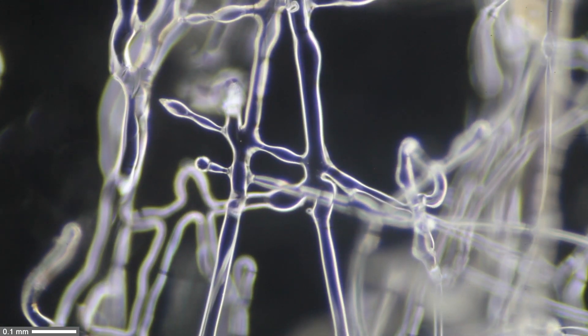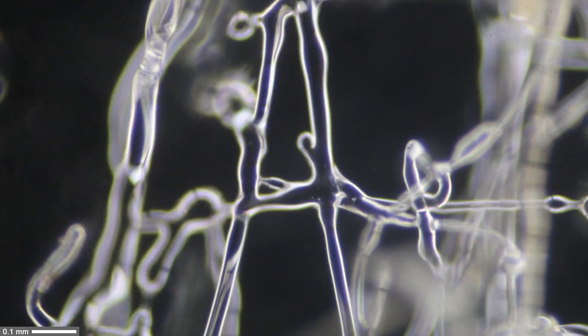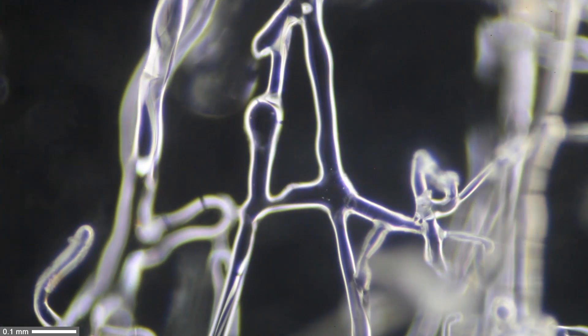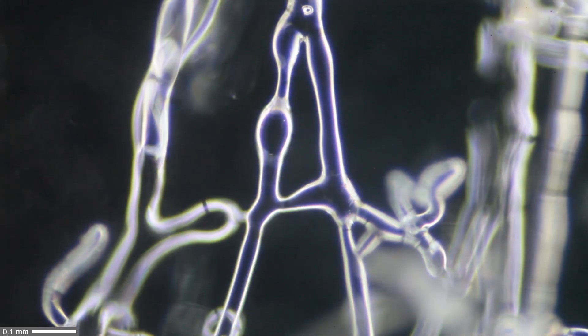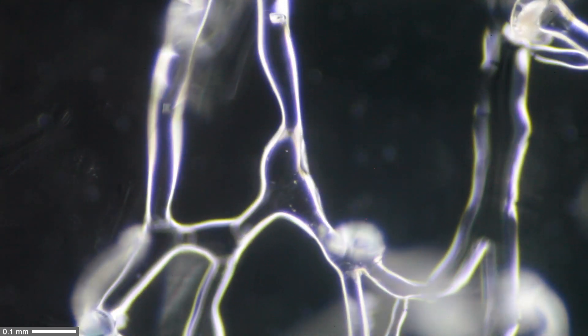You can see how it turns liquid because the sugar attracts moisture very well. I'm switching back to dark field and you can see the cotton candy fibers dissolve. I'm repeatedly blowing on the slide and you can see the fog as the water condenses.